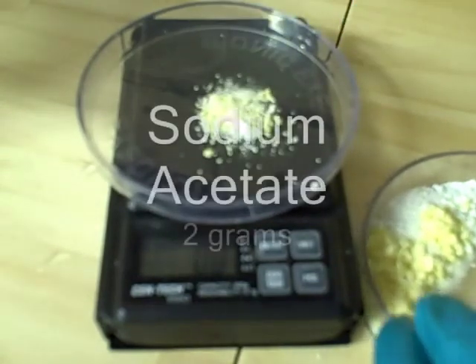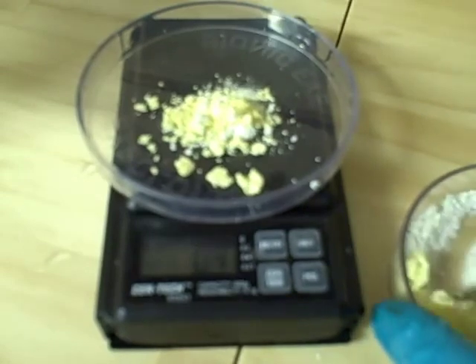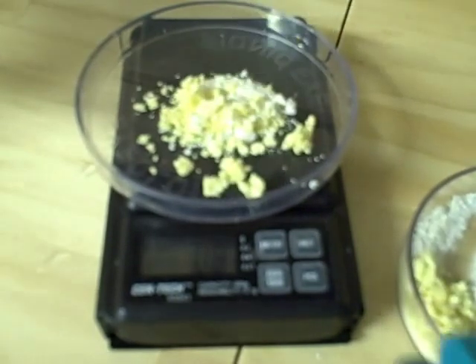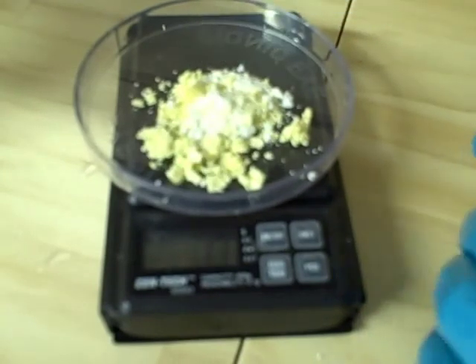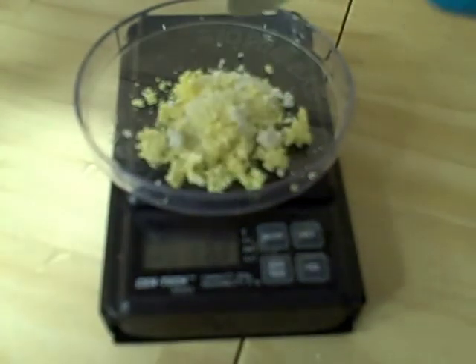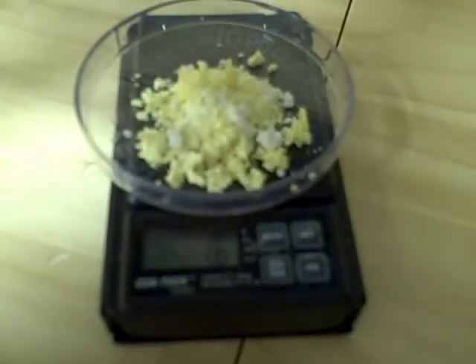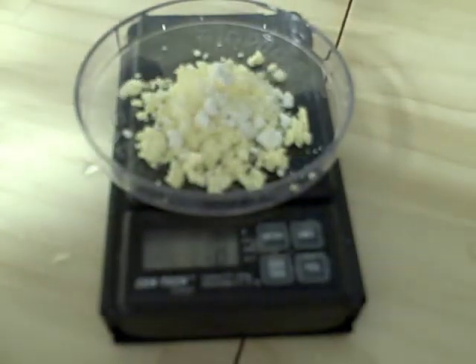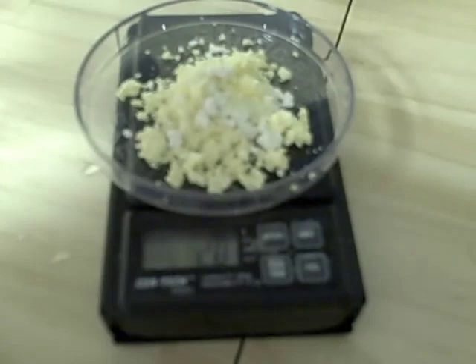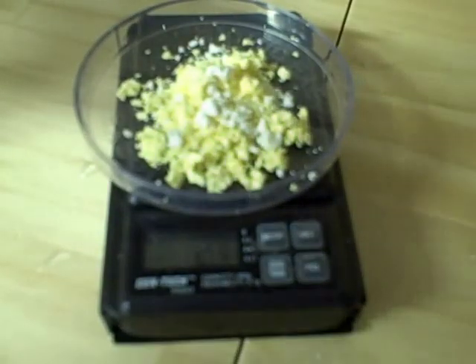Now we're going to keep putting it on until we have two grams. That's about three tenths of a gram right now — 1.1, 1.4, 1.6, 1.8, 1.9, 2. So that's how much of our sodium acetate we're going to need.